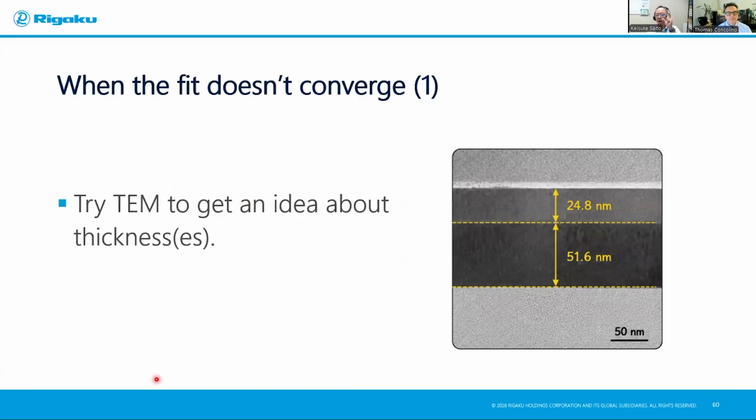So if your polymer has enough density difference compared to the substrate, your thin film should show the reflectivity profile. But if the substrate and your layer have similar density, then from the X-ray viewpoint the interface is not clear. In such a case, you may not be able to see beautiful thickness oscillations because of the lack of density contrast. I hope I answered your question.